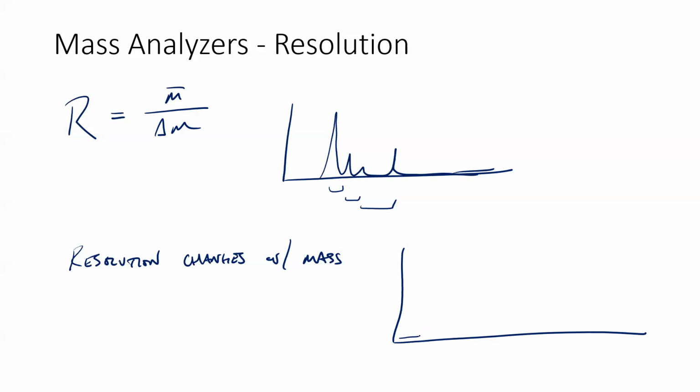The paper looks like this. Here's a peak that's very narrow, and here's a peak that's very narrow. There's a whole lot of baseline between them, right? This Cl plus, this Cl minus, right? So the difference of 2 electrons, and they're that well separated. Right? And so it's not uncommon for you to have resolutions of 1 million or 10 million on an FTICR MS. Okay.